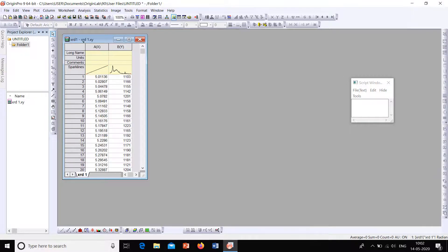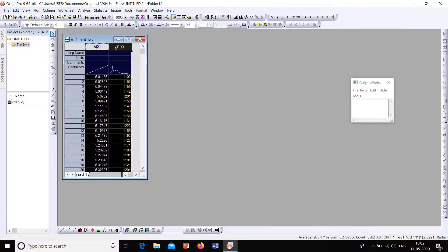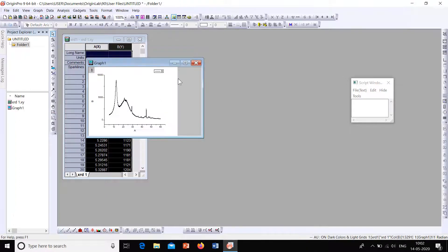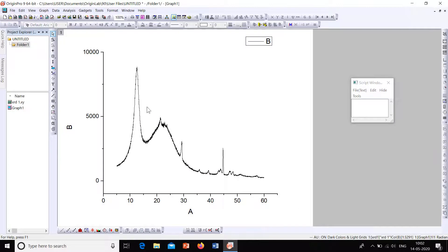The data is now imported to the workbook. Without giving any name or units for now, let's select the X and Y axis then go to Plot. The XRD has been plotted. Now let's move on to beautification.